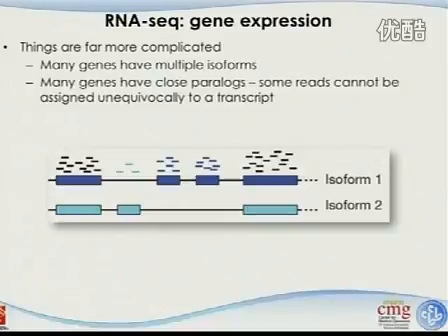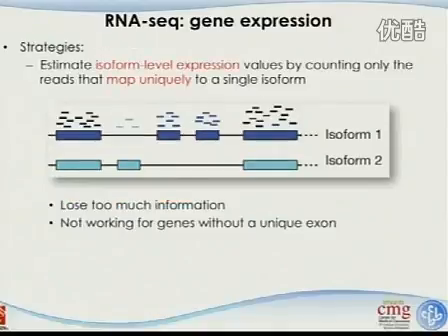And you can see that what we are observing is that at this location there are so many reads accumulated, at each individual location. But how can we reallocate each individual read back to its proper isoform? It can be tricky, right? For these two, we probably can think, oh, let's just use this to measure isoform 1, and use this to measure isoform 2. Those are pretty straightforward. But for the constitutive exons, which means the exons are in both isoforms, how do we know which read is from which isoform?